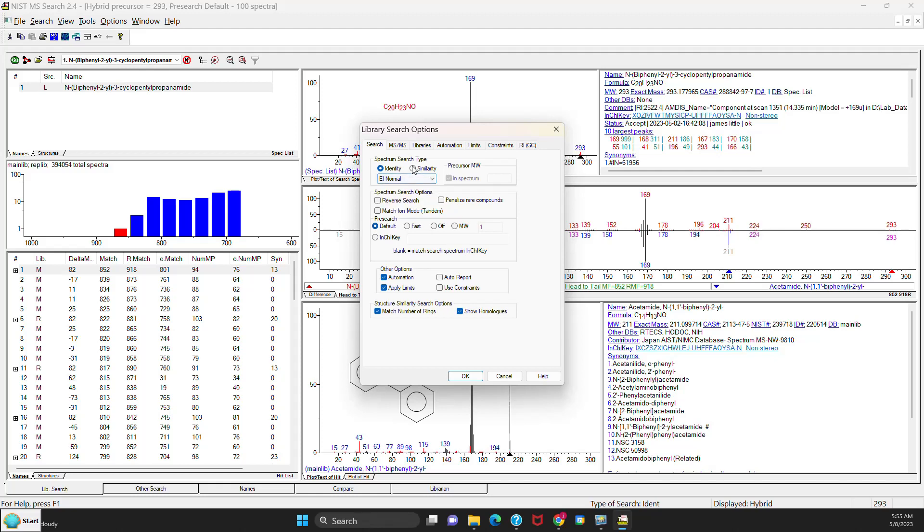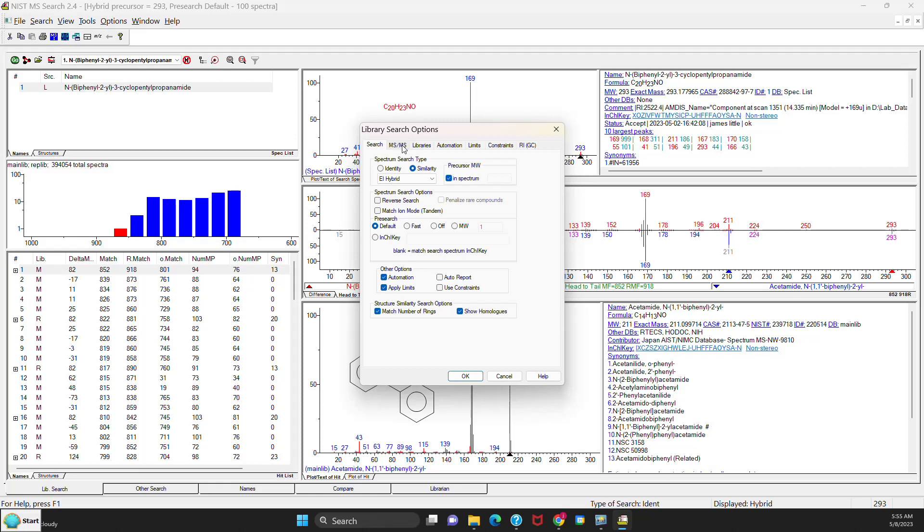And also for the similarity, you'll have all the choices there for both EI and MS-MS. And one more thing, the MS-MS menu will appear at all times.